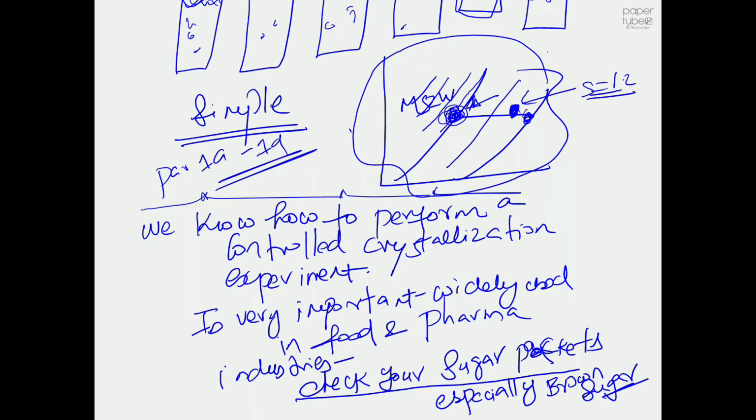I'm saying that we did it in the lab because you are going to write the experiment assuming that you did that experiment. Obviously, if the situation were normal, I would have taken you to the lab while I was doing that experiment. So just think you did the experiment. I only assisted you, and you are the one who integrated the PAT tool into the crystallizer, and you are the one who did the experiment. So that's how it works.